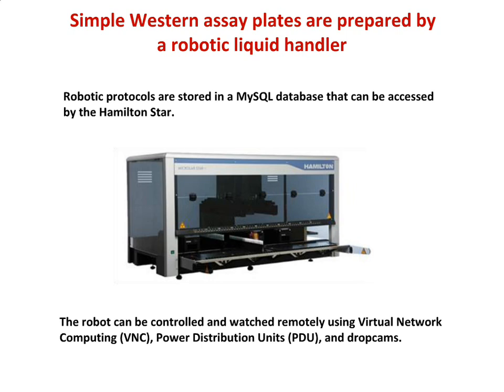Once our experiment is done, after the operator has loaded the Wes assay plate into Wes and clicked the go button, we get our data back. And as Andrea explained earlier, we get that data back within 3 hours of starting this experiment, which is absolutely amazing.